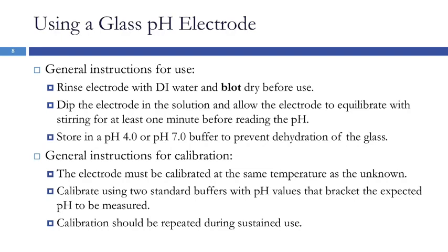Now, if you're going to use it just in another sample very soon, you could rinse it and set it down, or you could just go directly to another sample, but you don't want that electrode just sitting on the counter or hanging from a ring stand for an extended period of time because the glass will dry out. It needs to be hydrated, and if it's allowed to dry out, then you're going to have to condition it and equilibrate it again, and you'll lose time doing that.